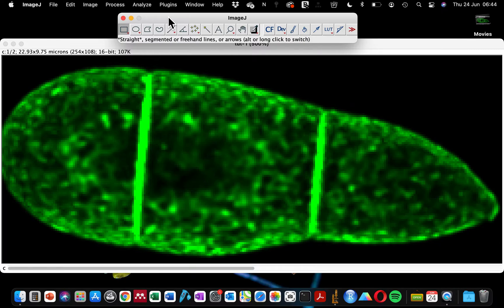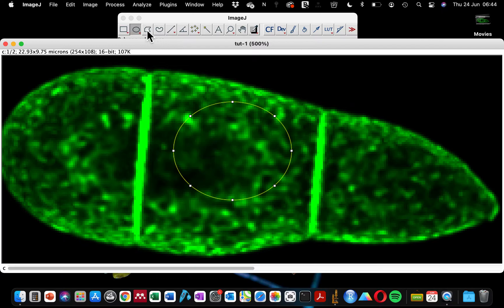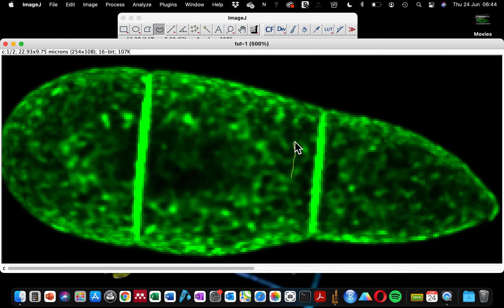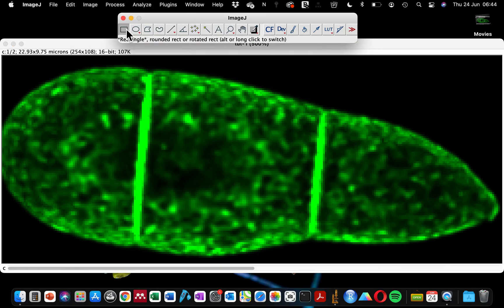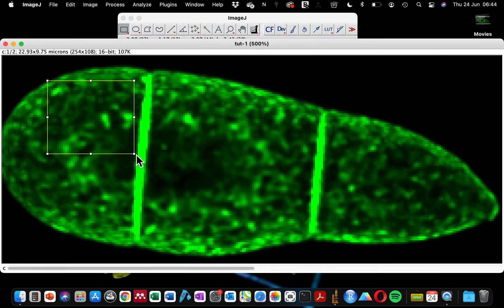For the quantification of fluorescence within a region of your sample, you need first any of the selection tools. You could either use the rectangular selection tool or the circular one, or you can use the polygon selection where you can draw which part of the image you want to quantify. The last selection tool is the freehand, whereby you click just once and drag your mouse over a region that you are interested in measuring.